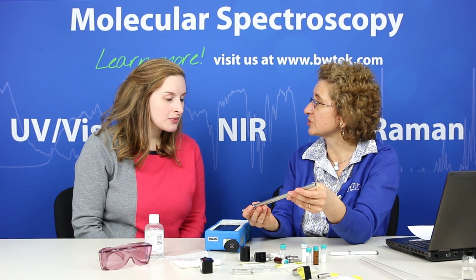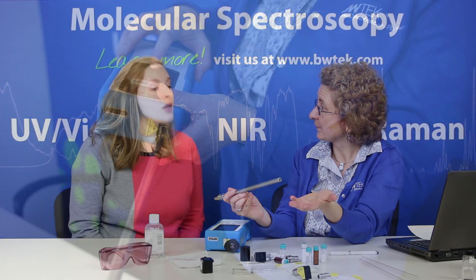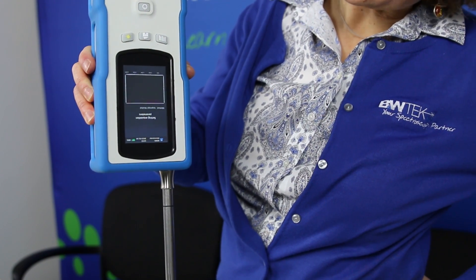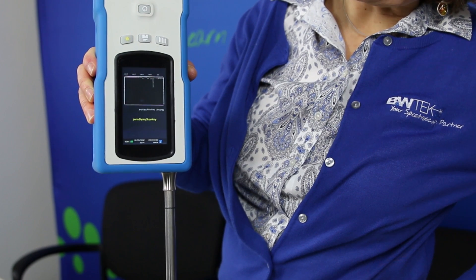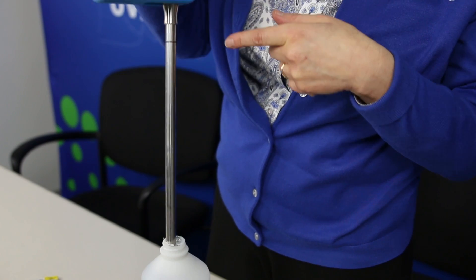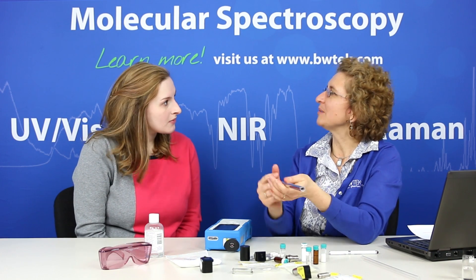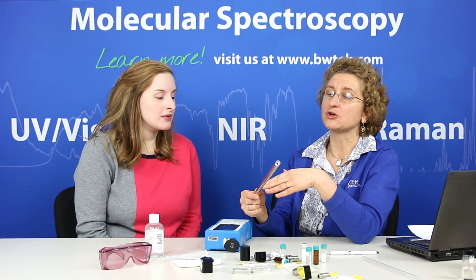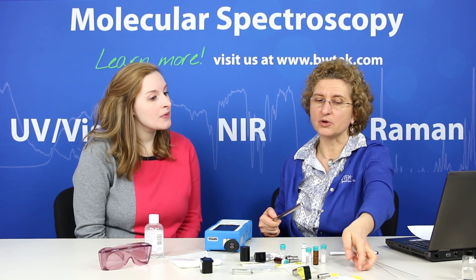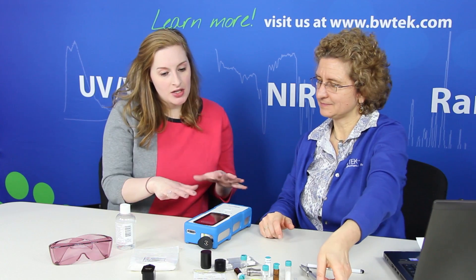Another very versatile accessory is our immersion probe — a 316 stainless steel immersion probe. With its length, this enables you to measure things that might be in a larger container. So if you had drums in a warehouse and wanted to measure not just at the surface through the packaging but further into the drum, you could put this on and make that measurement. One great thing about it is that we have disposable covers for it, so you don't have to worry about contaminating samples. You make your measurement with the cover in place, then remove it, throw it away, and get a clean cover for your next measurement.